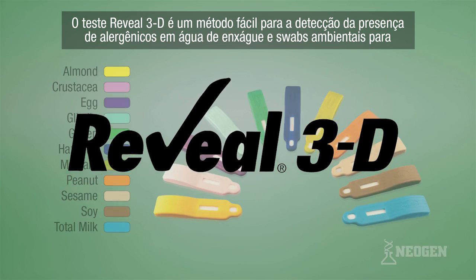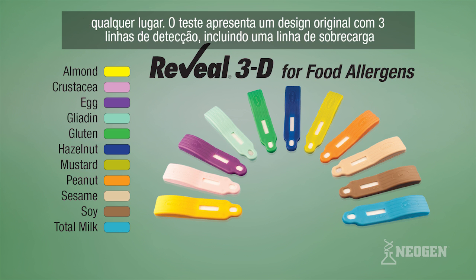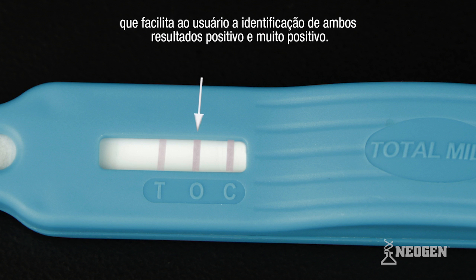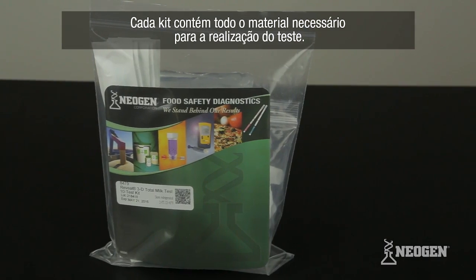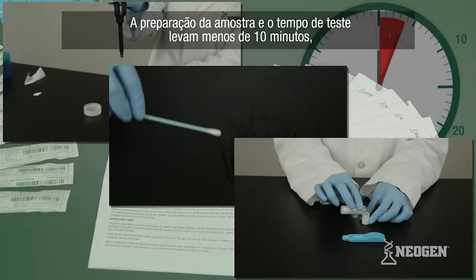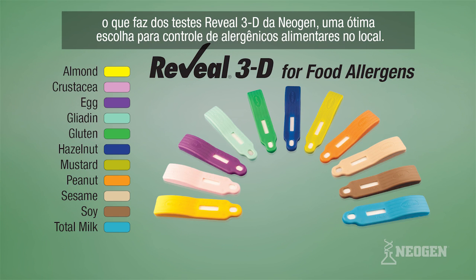The Reveal 3D test makes it simple to screen for the presence of low levels of allergens in CIP rinses and environmental swabs virtually anywhere. The test features a unique three-line design, including an overload line, that makes it easy for the user to identify both positive and high positive samples. Each kit contains everything required to perform testing. Sample preparation and testing takes less than 10 minutes, making Neogen's Reveal 3D tests a great choice for on-site food allergen control.